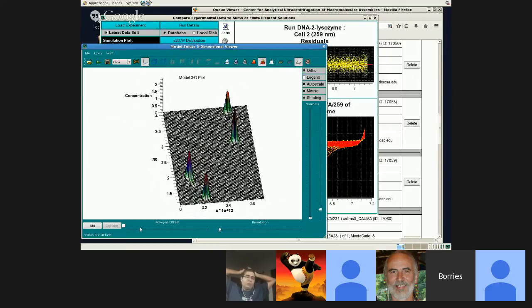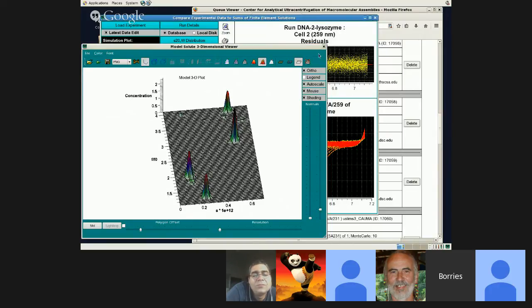So we're telling apart two molecules that are basically different shapes and different size, and we can tell them apart. Now, it returns two peaks right now, and that may be because of our selection of our limits, but later on when we refine the data, that should go into a single spot, and I'll show you how that works.